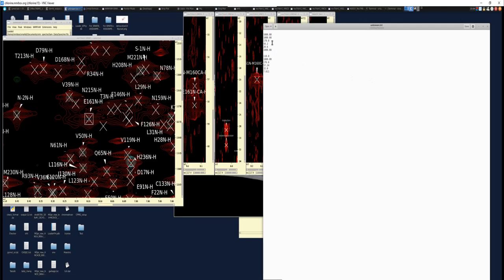So if we go to our unknown text here, we can fill these in now. Right, so this is 117.4. So instead of 1,000, 117.4. And the hydrogen is 8.141. But now we have a new I-1 with extra information.